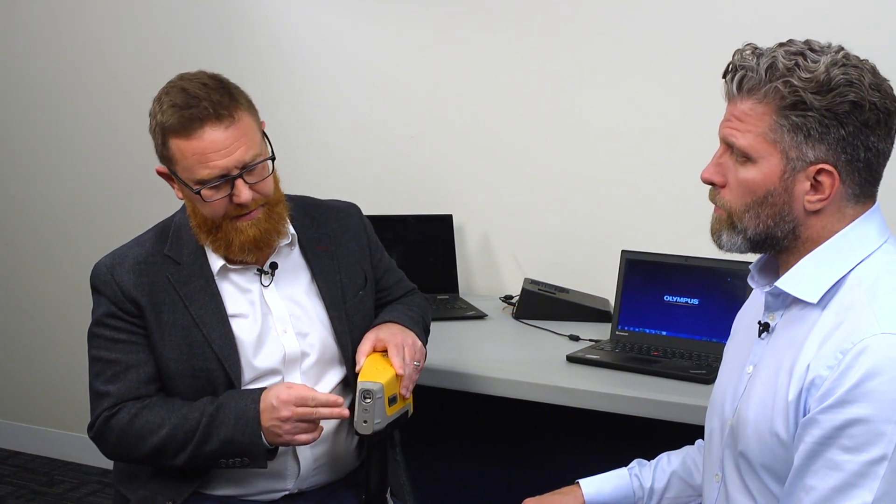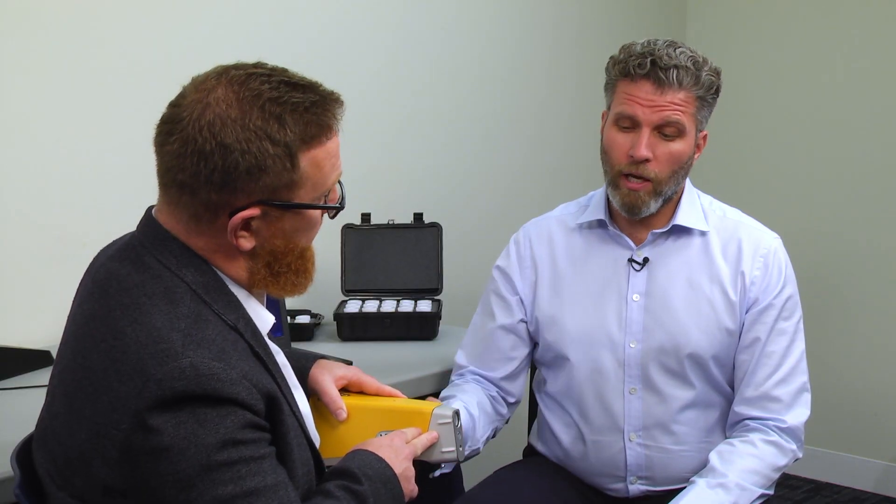Well, I thought today's discussion was about our sample containers. It is, but the concept we need to get across before we start talking about sample containers is that whatever is between the detector and the tube inside here and the sample will affect the performance of the instrument and attenuate x-rays. So what you're saying, the thickness and the density of that window is very important to your XRF analysis. It is.